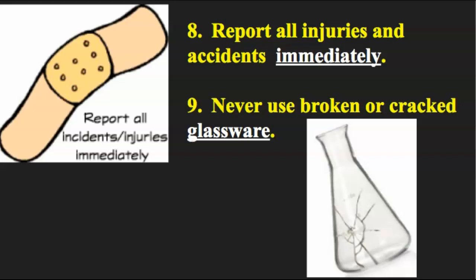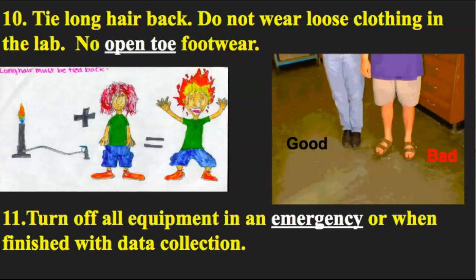And number 9, never use broken or cracked glassware. This can be a hazard to you. If you use cracked glassware and you try to heat it up, it could potentially explode on you. That would be bad news.